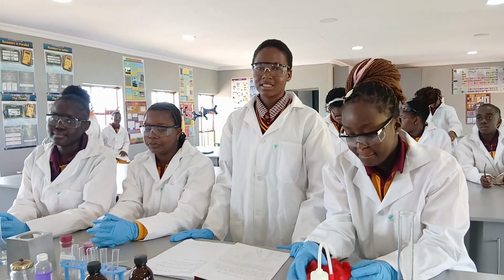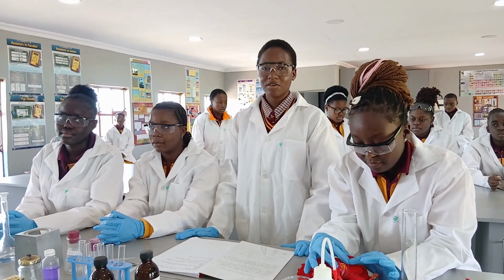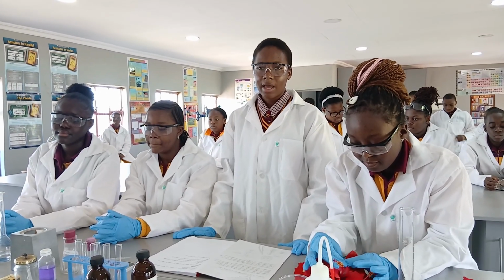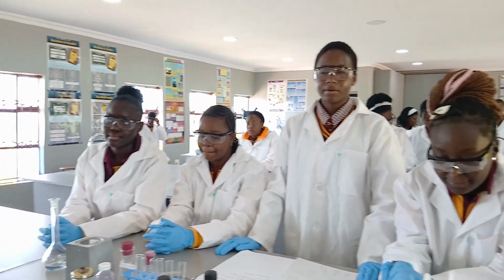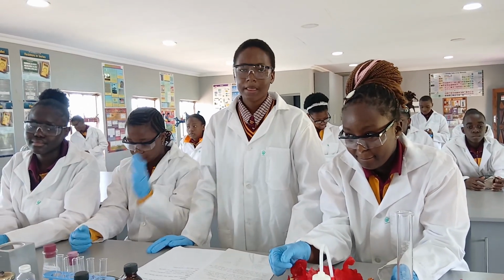The respected teacher and my fellow learners. Standing before you is Bukola Malebe, a grade 9 learner from Bright Star Christian High School and a member of the Science Club. I'm here with my group members, Dono Maluleka, Kifo Mabasa, and Sabo Chaba, and we'll be preparing an acid and base indicator using a hibiscus flower.